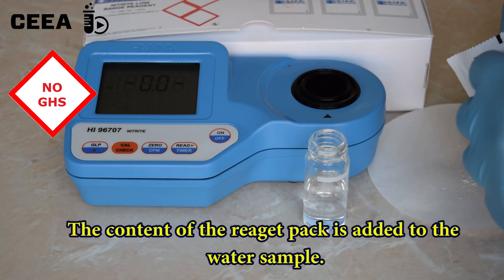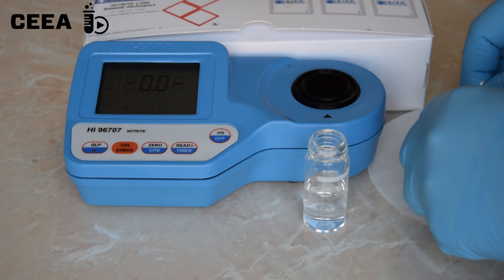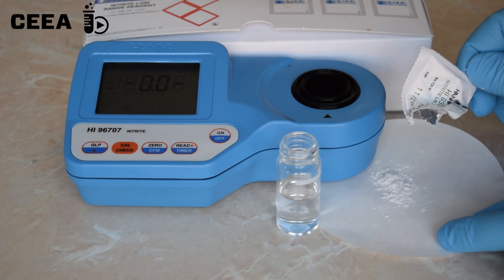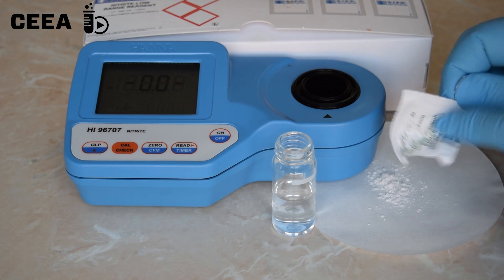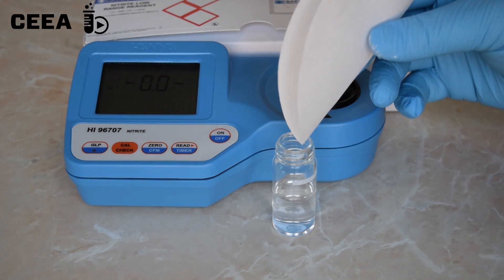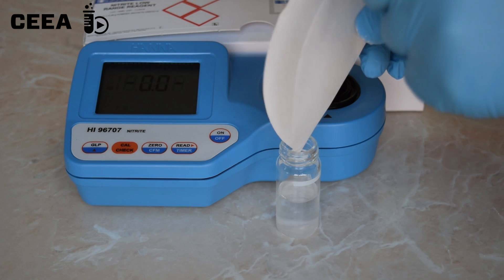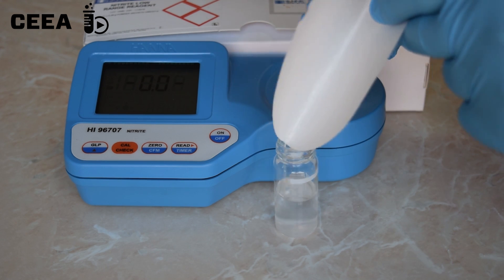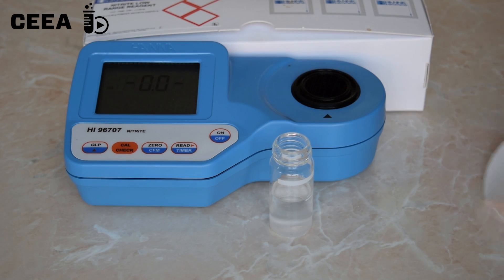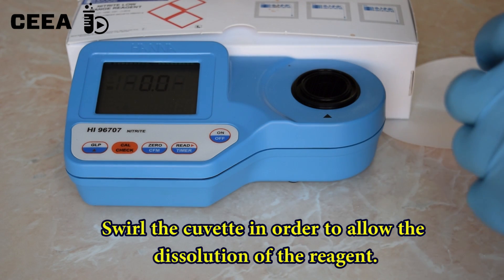Then the content of a reagent pack is added to the water sample. The solution is mixed by swirling the cuvette.